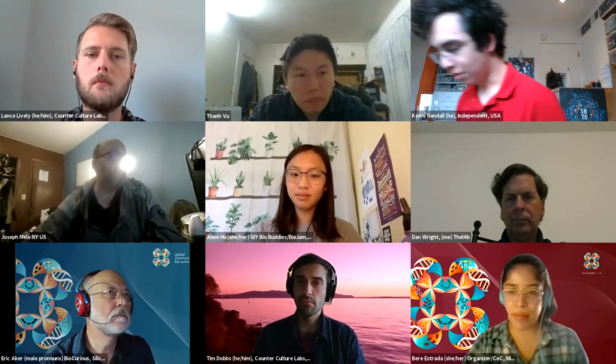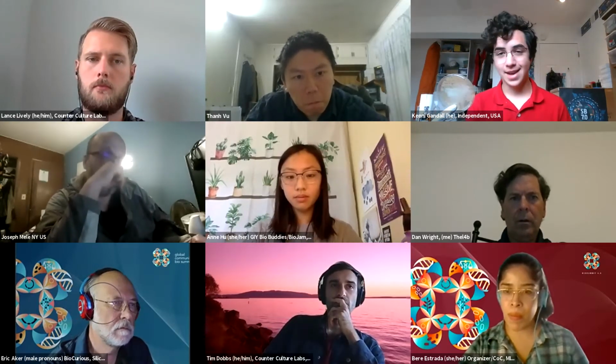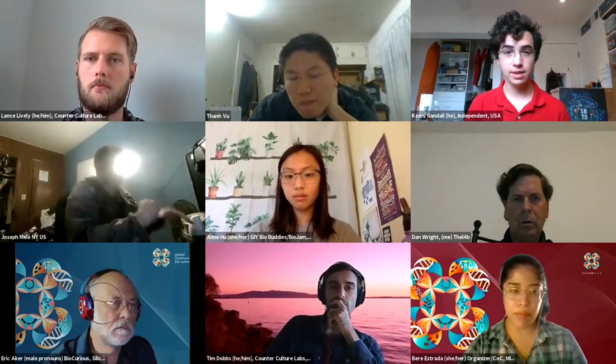The knowledge to put them on paper, it's actually really easy. Really stupidly easy. All I did to produce these, and I produced about 200 of them, I took a petri dish that I streaked out a whole bunch, and I left it in the incubator for about 8 or 9 days. And then I took a pipette and tried to get as much off as I could, put that in a water tube, and that's it. I put a little bit of food coloring so that you could see them better, but literally all you need to do is leave these in the incubator for a week or so.